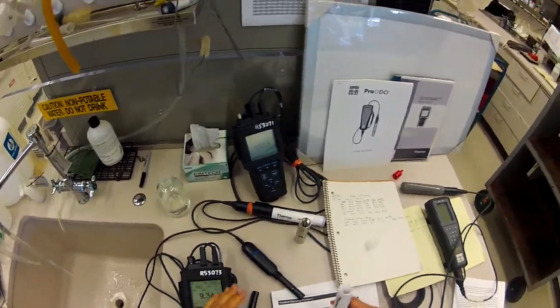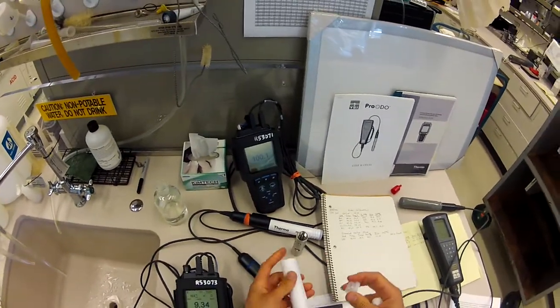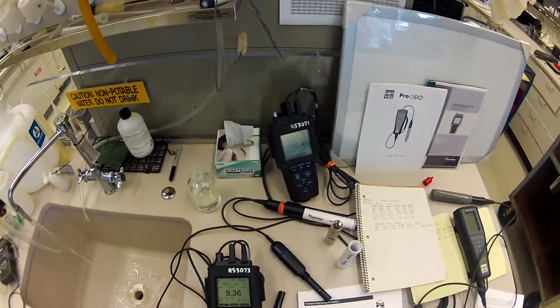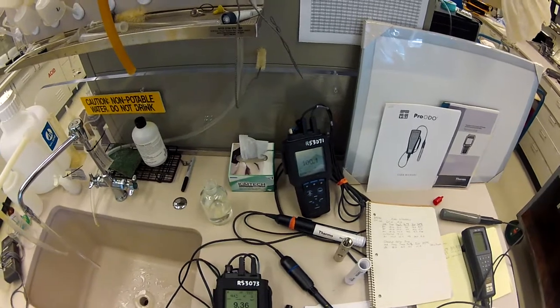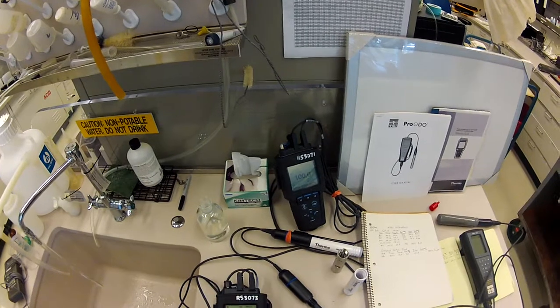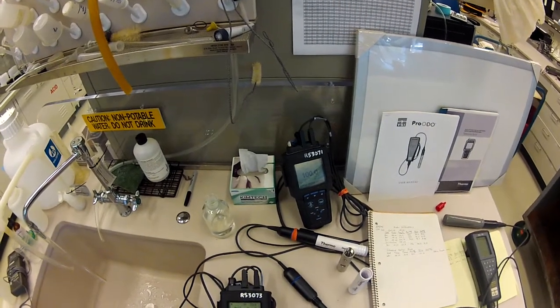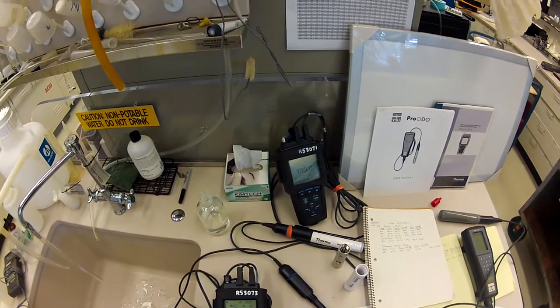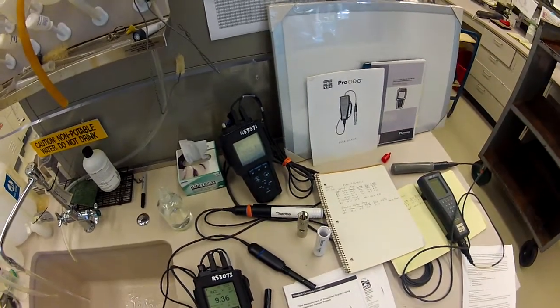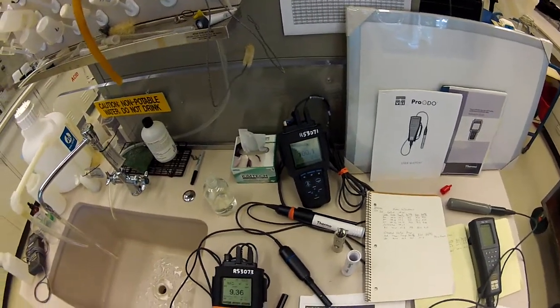You're also going to need - the meter will need to have some type of barometer or some way of determining atmospheric pressure, because your standard, the concentration of your standard, is going to be determined based on the barometric pressure and the temperature conditions for your water-saturated air.